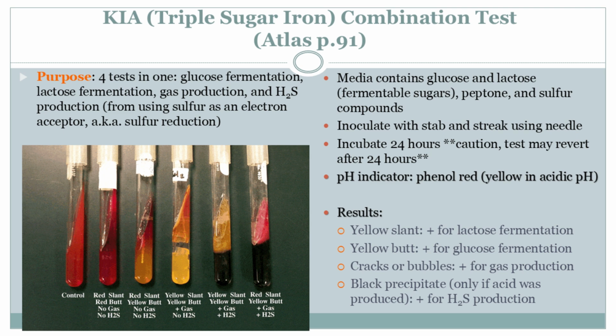But what if the agar is just stubbornly staying red? Like refusing to change color at all? Then we might be dealing with some more discerning bacteria. Red slant and butt usually points to a lack of fermentation going on. These bacteria, they're strict aerobes. They need oxygen to survive, and they'd rather get their energy from that peptone we talked about earlier.